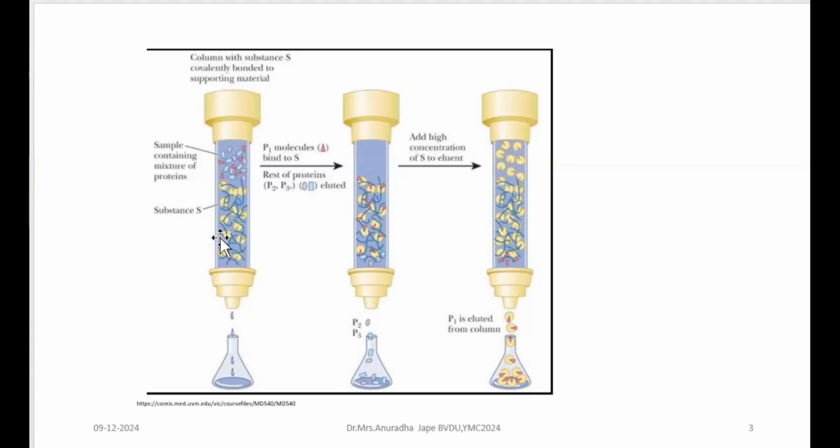Now, in enzymology you have heard the terms substrate analog, inhibitor, activator, substrate, etc. So here I am going to talk about the substrate analog that is used for purification of a protein which is enzymatic in nature. What is an analog? It is the molecule which resembles the substrate, but it is not able to take part in the reaction. It is not capable of reaction. So such a substrate analog, which is specific for the enzyme, is to be coupled to the column matrix.